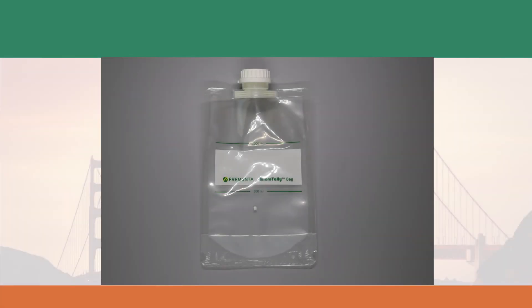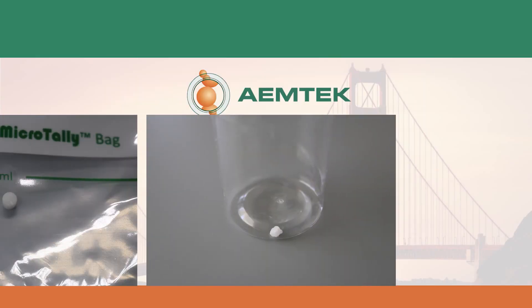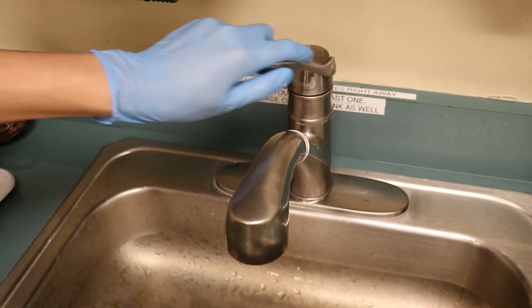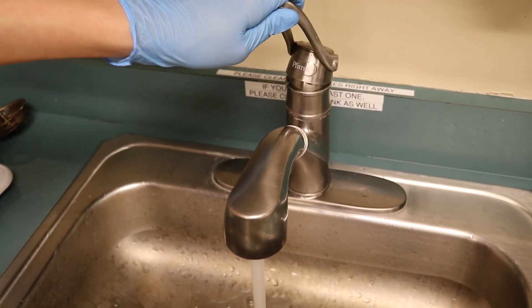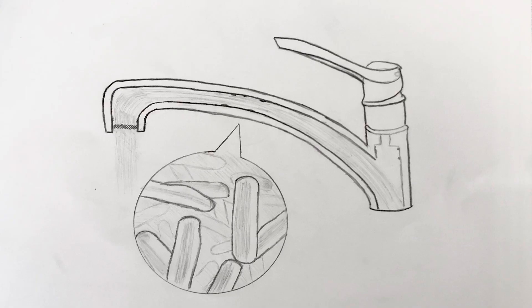When taking water samples, use the 1 liter liquid bag or the 100 milliliter plastic bottle if you believe the water source is contaminated. Each container contains a proper amount of sodium thiosulfate for neutralizing residual disinfectants. Turn on the water and let it run until the water is warm but not hot. The goal is to obtain water currently in the piping behind the fixture along with any material shed from the biofilm.